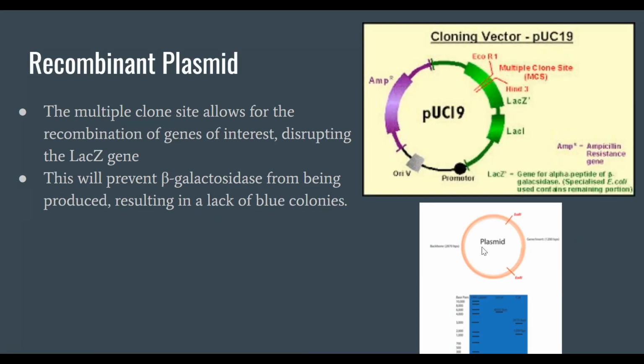So here in the bottom image, we're seeing the plasmid backbone, and then we're seeing the recombinant gene insert, and then we're seeing the EcoRI cut sites on either side of that inserted gene. So the cut site is still in existence when we don't have a recombinant gene added to the plasmid. So this will be relevant when we talk about plasmid digestions, which will be coming up.